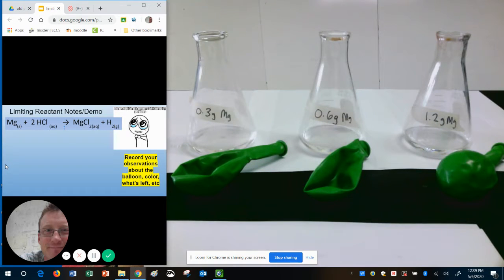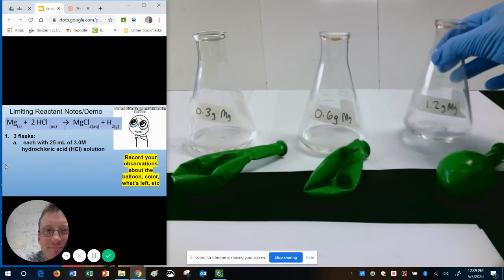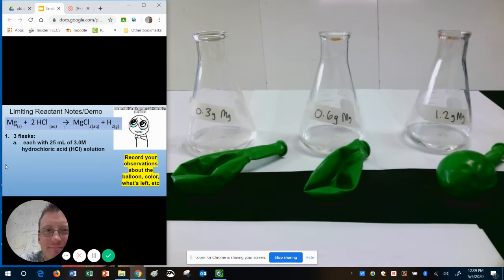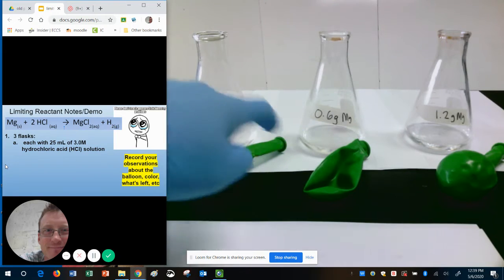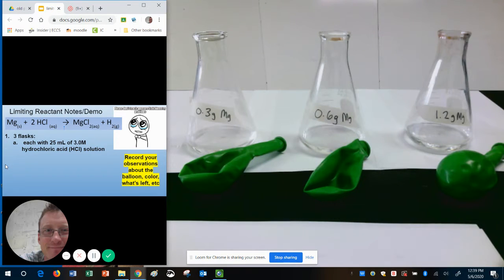If you see my screen here, in each of these three flasks I have 25 milliliters of liquid, the HCl. In each of these balloons we have magnesium powder. The amount is given on the tape: 0.3 grams in the first balloon, 0.6 in the middle one, and 1.2 grams of magnesium in the third.